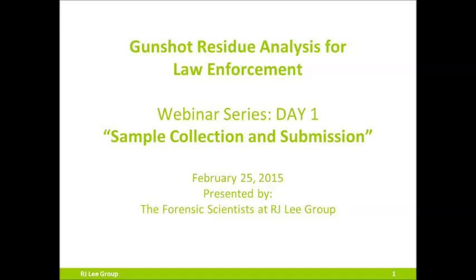Welcome to day number 1 of our webinar series, Gunshot Residue Analysis for Law Enforcement. Today's series will include sample collection and sample submission. Day 2 of our webinar series will be about sample analysis and some testimony considerations.